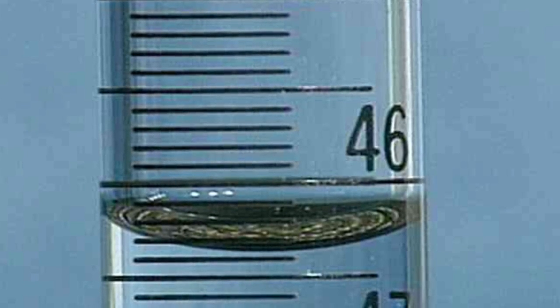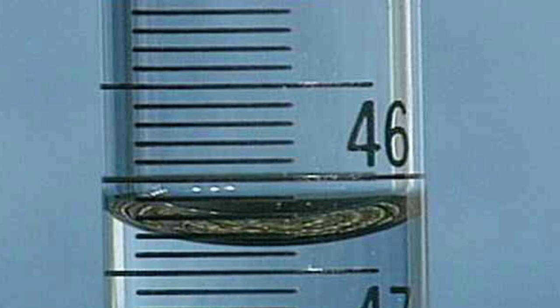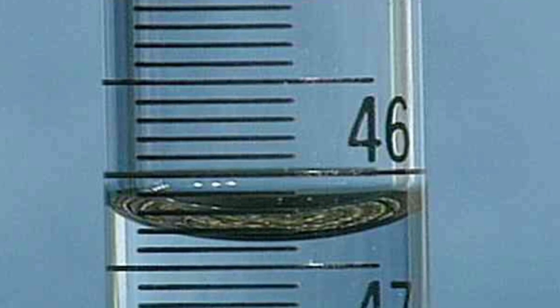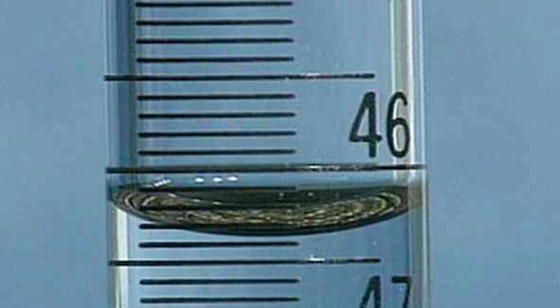A meniscus is the curved upper surface of a liquid in a tube. It occurs because the water molecules in contact with the glass begin to crawl up the edge of the container.